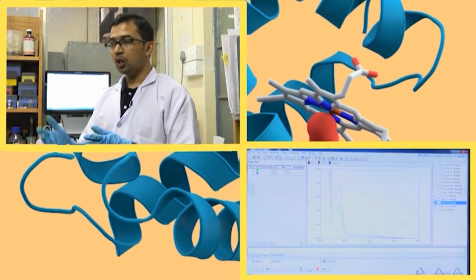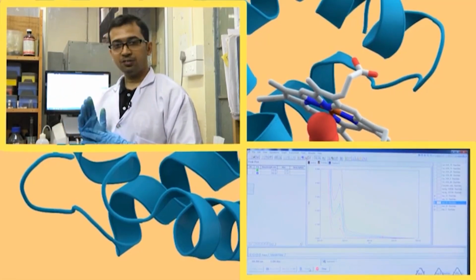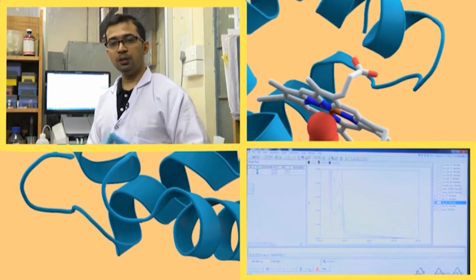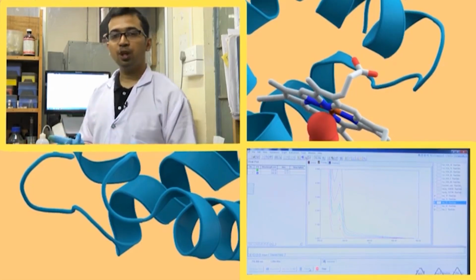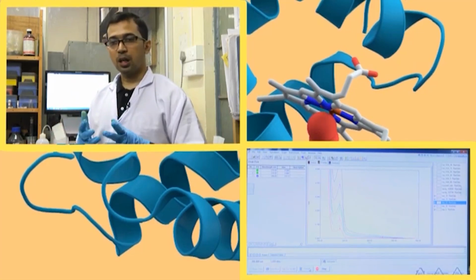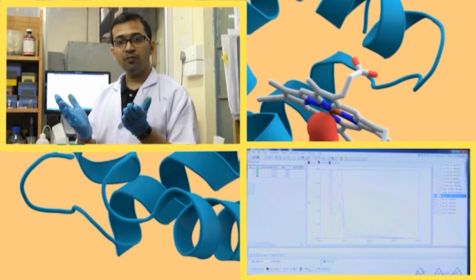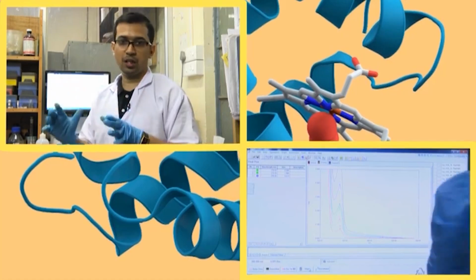Whose concentration? The concentration which you are varying. Absorbance will be on the y axis, and concentration will be on the x axis. Coming to absorbance, it will be 1 by change in absorbance, that is, the reciprocal of the change in absorbance. The change is from the initial absorbance of the ligand which we are measuring.